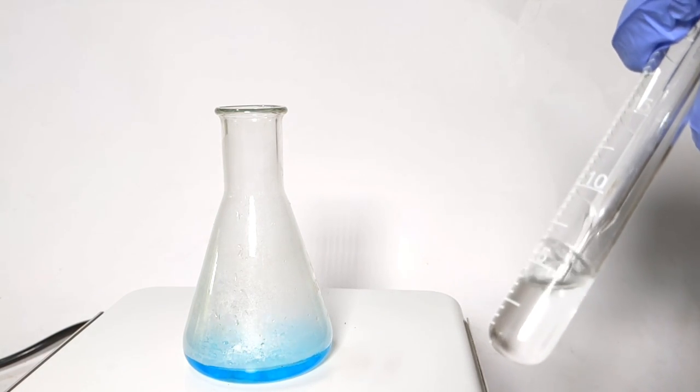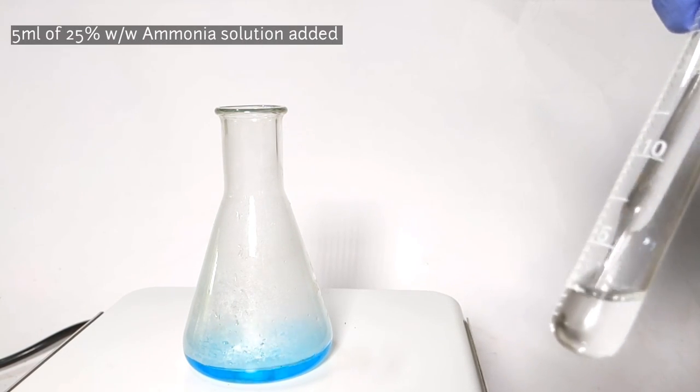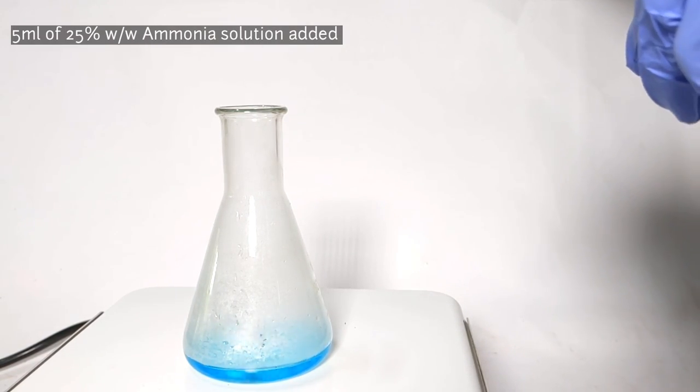Now with constant stirring, add 5 milliliters of 25% weight by weight ammonia solution using a dropper.